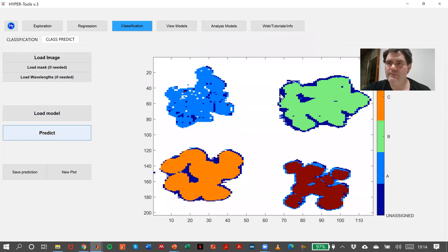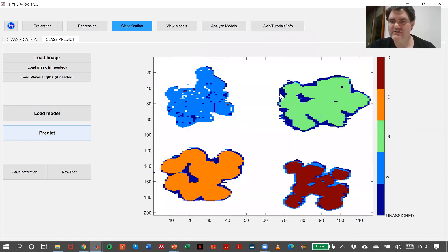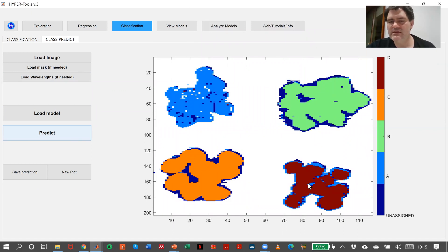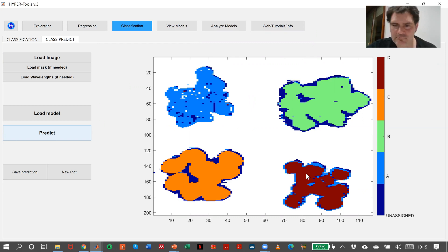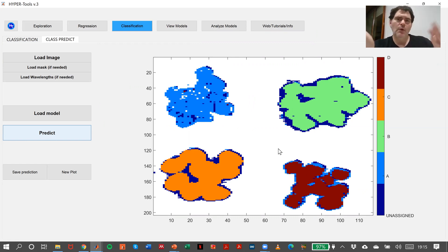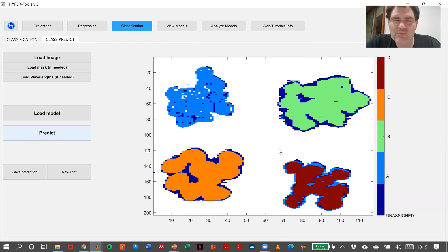There you are — this is the prediction. As you can see, this is plastic A, plastic B, plastic C, and plastic D. Of course, we have some unassigned pixels and some misclassifications, which is quite normal. So we can save this prediction to our workspace because afterwards we can work with it.